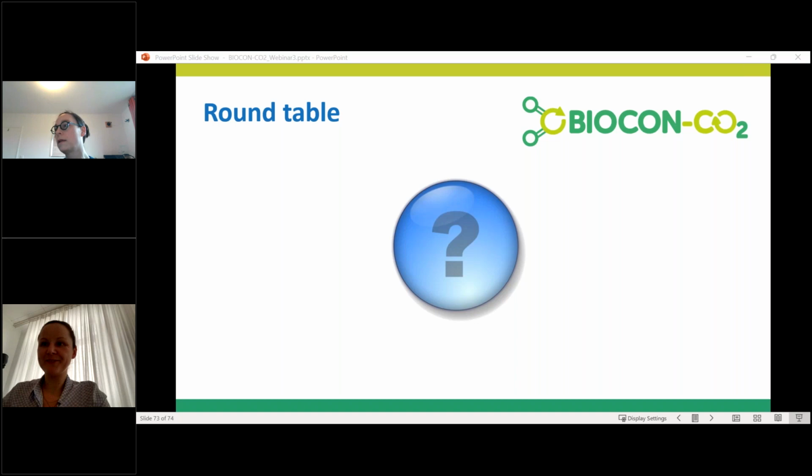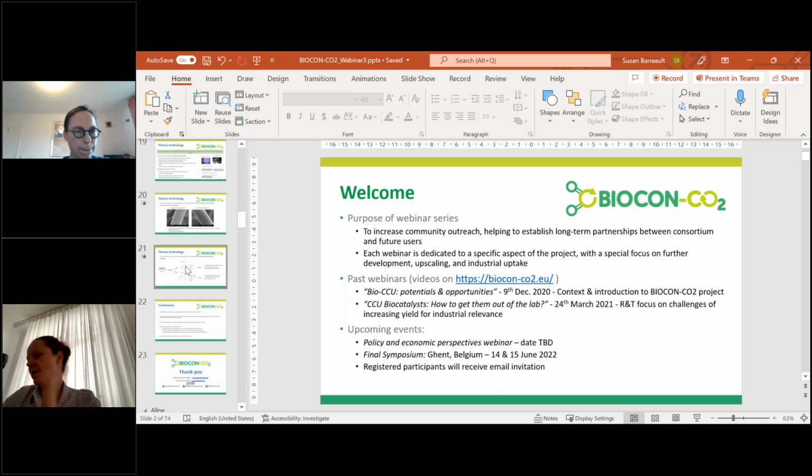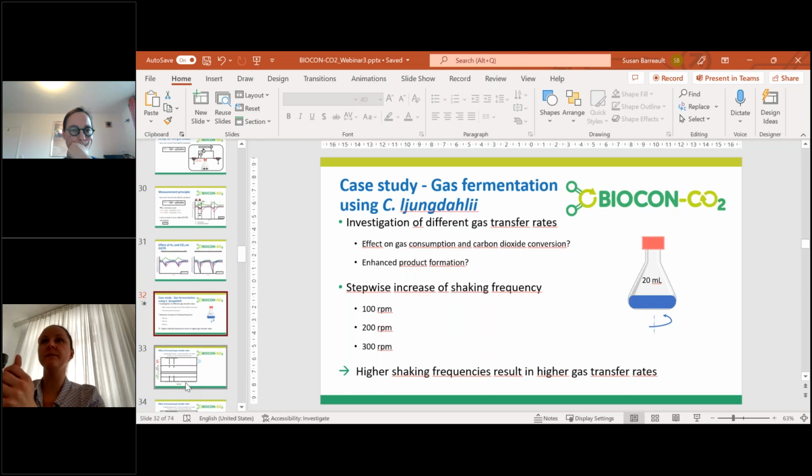No, so this is a good question, thank you. Maybe Susan, you can go to my last slide, where I blended all the results together. I think it must be 32 or 33, something like that. For Clostridium ljungdahlii, if we just feed carbon monoxide into the system, having carbon monoxide as the sole carbon source, we do see actual CO2 production. So the organism is not consuming CO2, but is producing CO2.